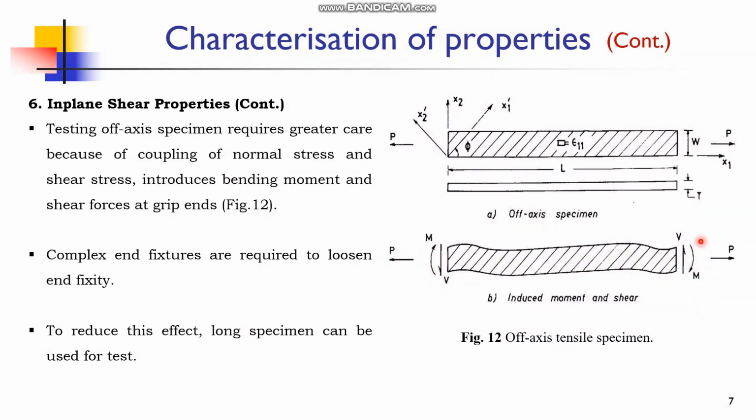To avoid this effect, one can choose specialized fixtures which permit small movement at the end and reduce rigid clamping effect.